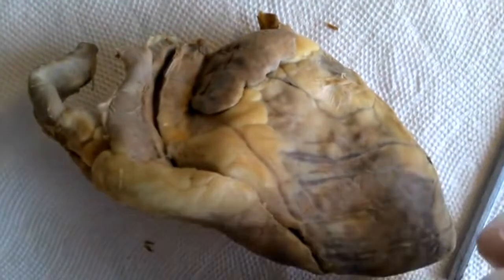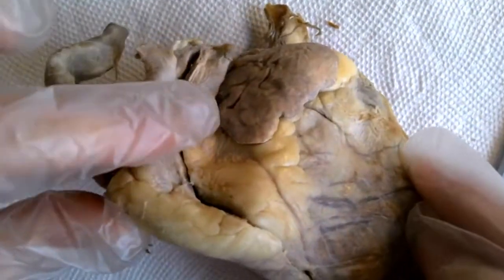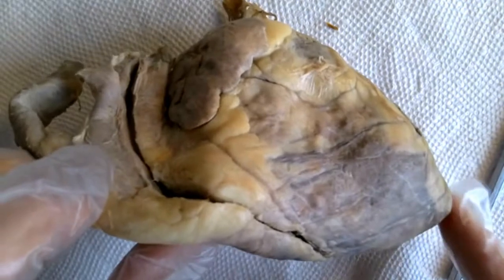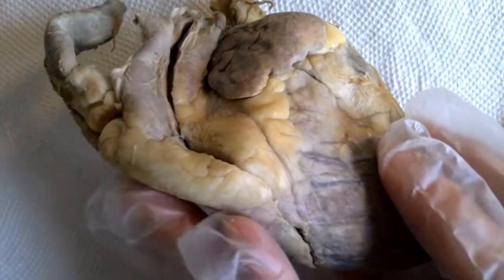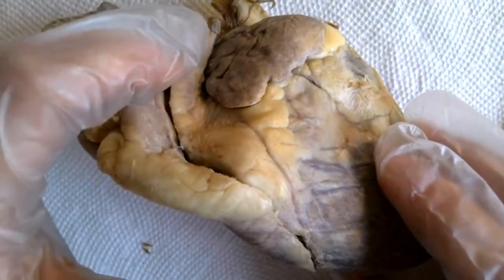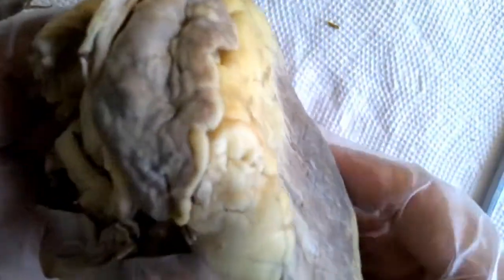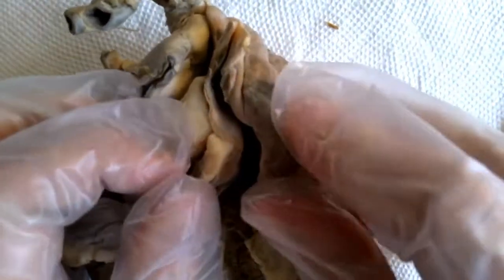So once again, looking at the sheep heart, look for the pulmonary trunk, the apex, this is the base, this is the right side. All right, pulmonary trunk comes from the right side of the heart, and we're going to go into the right side now. We're going to go through the back first, through the superior vena cava.